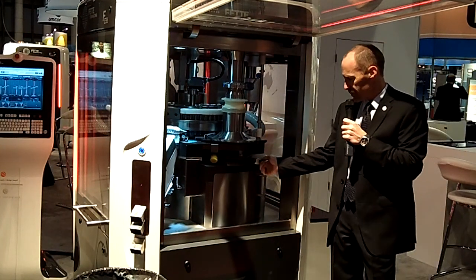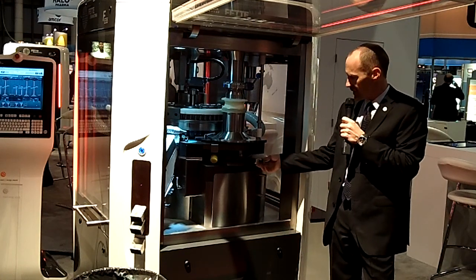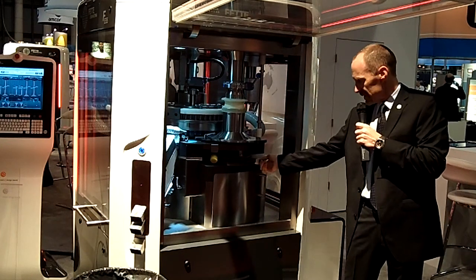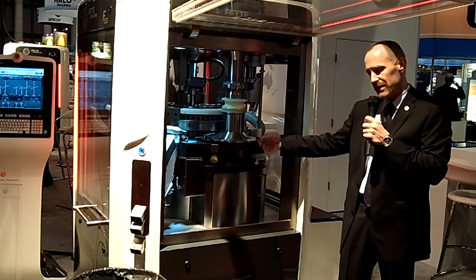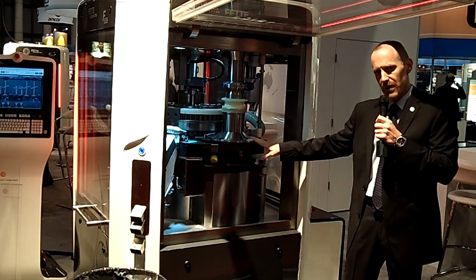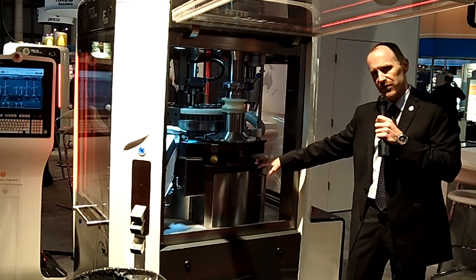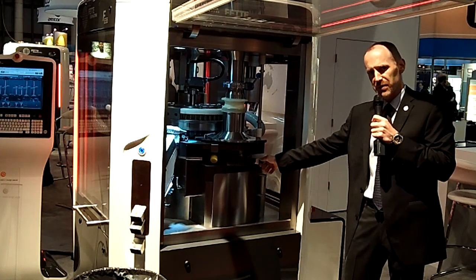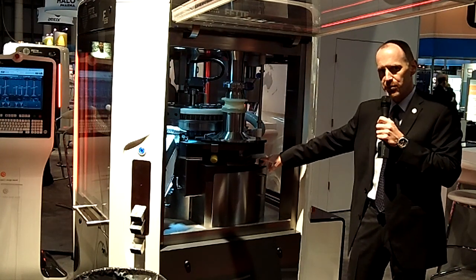From a maintenance perspective, there is also an ingenious design underneath the base of the filling cone. Through the use of an easily adjustable rail system, the user can manipulate the height of the feeder base plate in relation to the die table surface in positive lock increments of 30 microns. This is all about efficiency, and by being able to make this easy adjustment on the fly, the operator can optimize yields and minimize product loss.